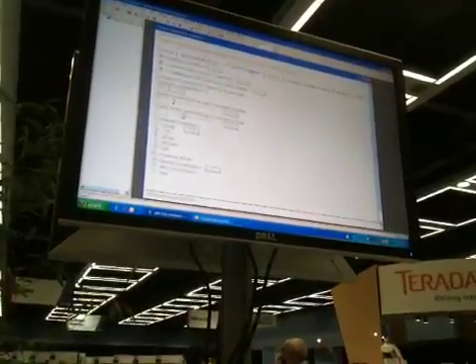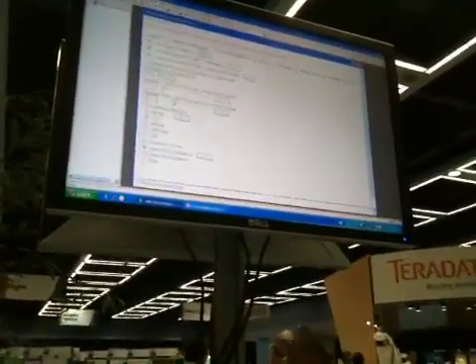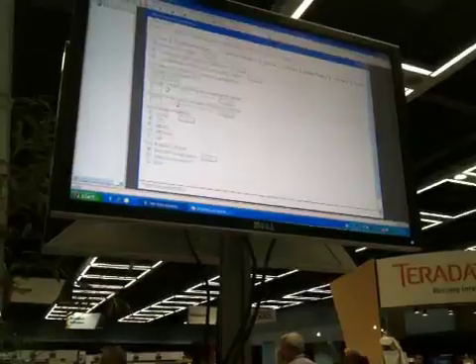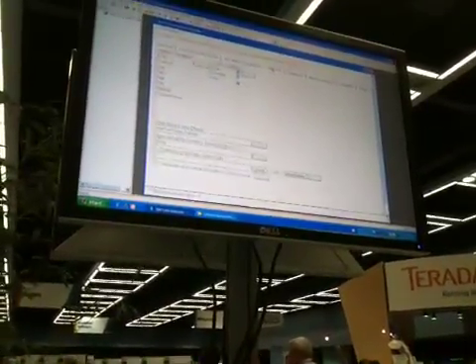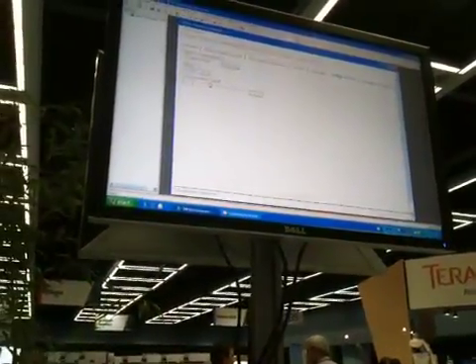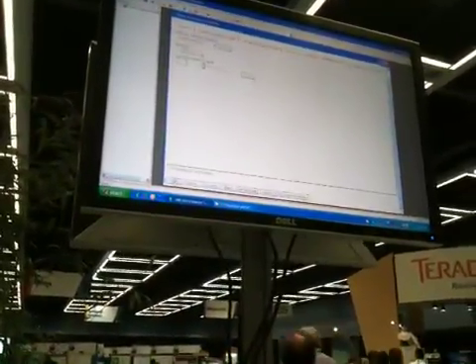We have lots of different ways to do quality control and normalization methods for expression data, as well as for SNP data, like distribution analyses, lots of correlation, principal components, and then you can fit your ANOVA model here to test for differential gene expression. We also offer lots of multiple testing because we are doing many tests with this. So let me set this running.